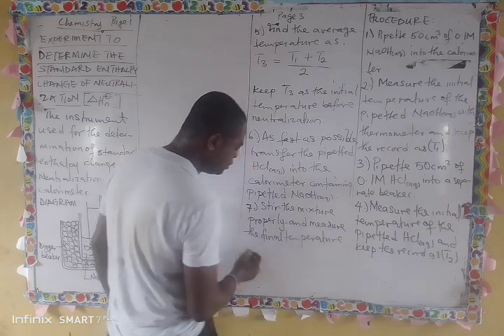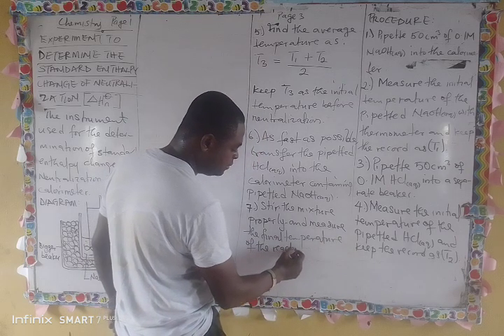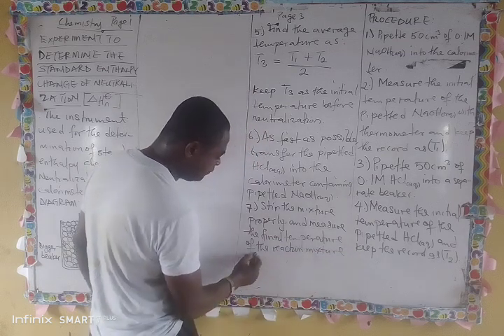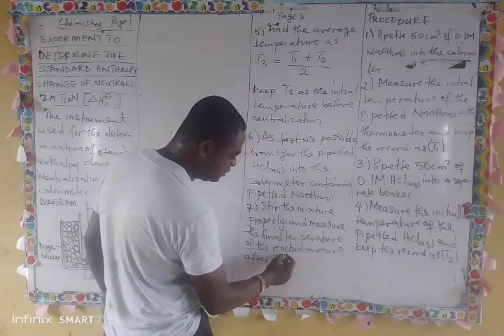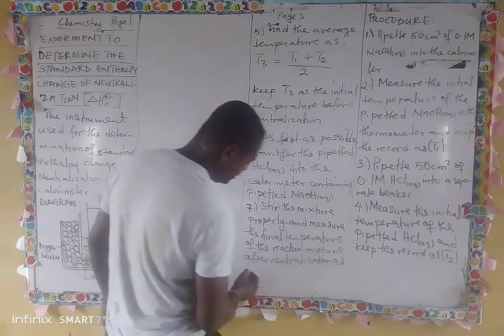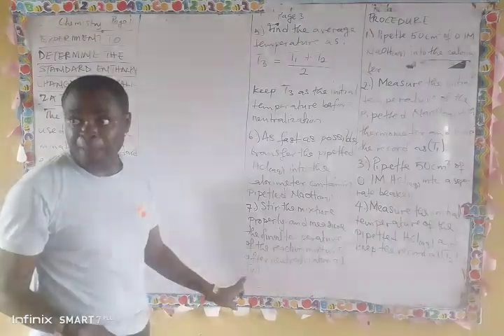Measure the final temperature of the reaction mixture after neutralization as T4.